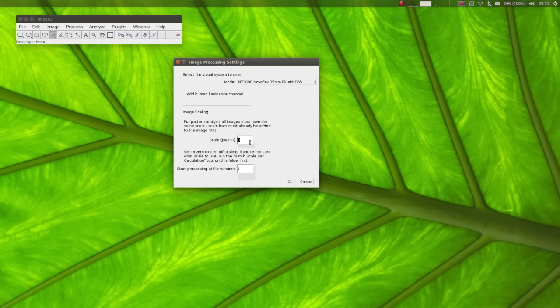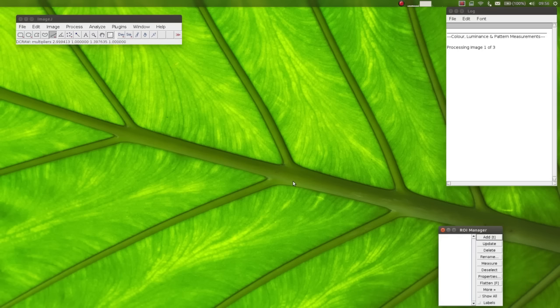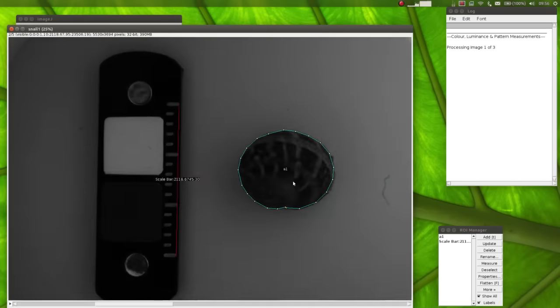Image scaling, that's the value of 70 pixels per millimeter that we want to use. Start processing at file number. If you're running a big batch analysis of hundreds of images, sometimes there might be a power cut or it might crash at some point. It will tell you the number it got to, and you can restart processing at, say, it got to image number 50, then just type in 50 here and it will restart at 50. Next, it will load up the first image and apply the blue tit model.